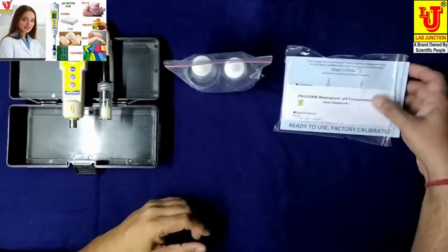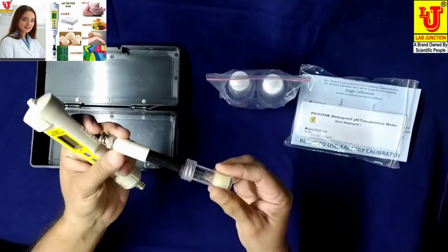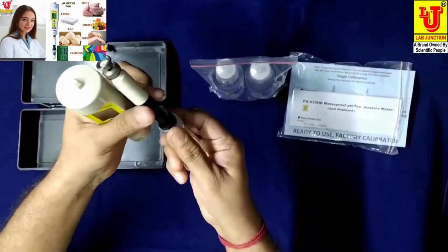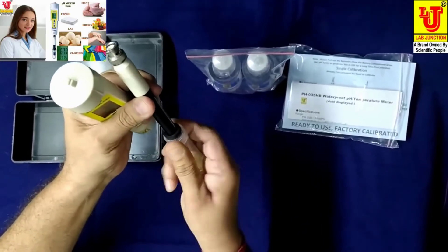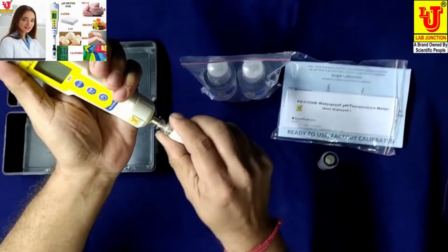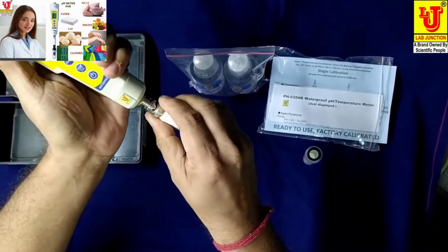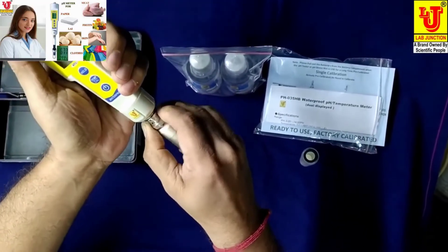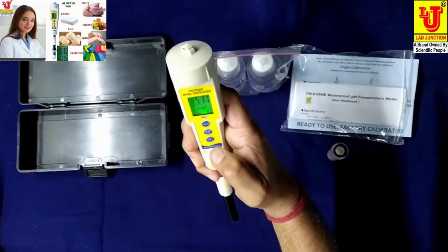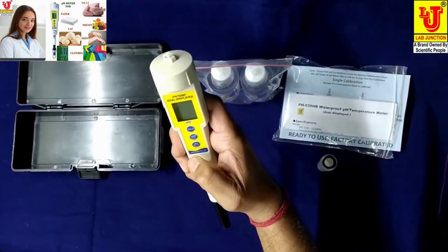Now, how to operate this instrument. First, this is the pH electrode of the instrument. Open the storage bottle and connect by push and twist — like you see, push and twist. To switch on, press this key to the ON position; to switch off, use the OFF position.